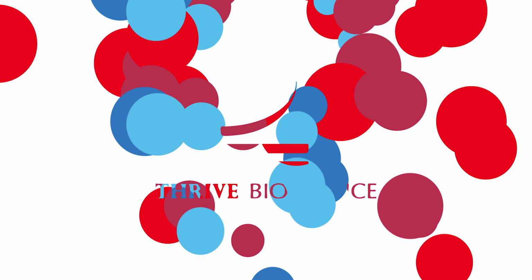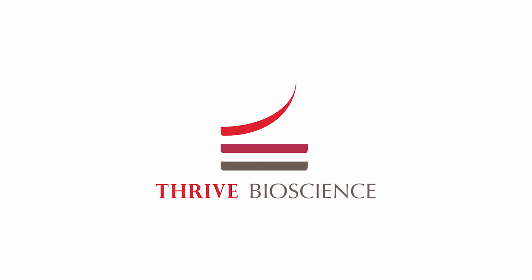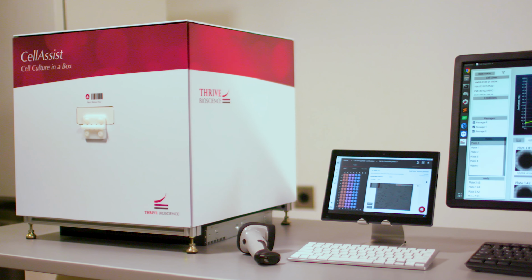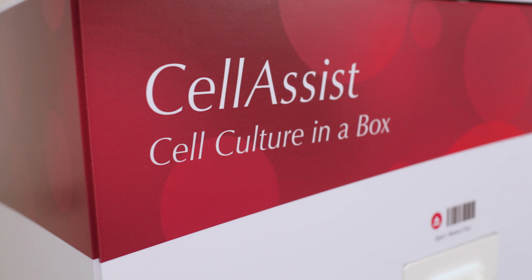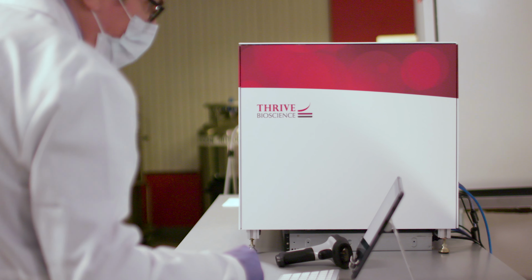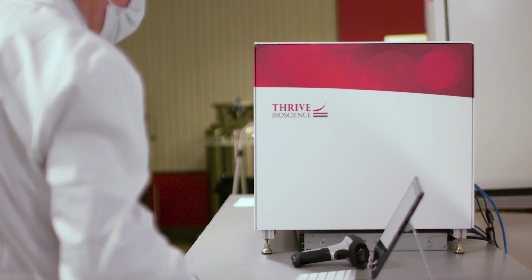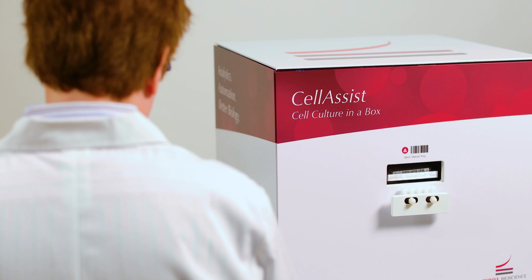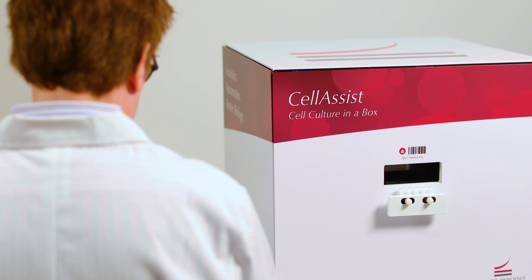Thrive Bioscience takes a huge step in the evolution of cell biology by combining a state-of-the-art cell imager with advanced analytic software. CellAssist is a paradigm shift, enabling deeper insight than ever before possible while documenting your lab's workflow and greatly improving the reproducibility and accuracy of your imaging and cell culture.